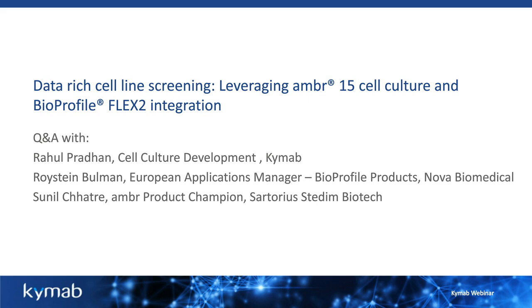Okay, thank you. Did you sample every day for the Nova analysis? Sample frequency? Yeah, so we did sample every day, but I should say that sometimes the pH sampling, for example, could have been done every other day, or we might have missed a day or two. But yeah, most of the samples were every day.